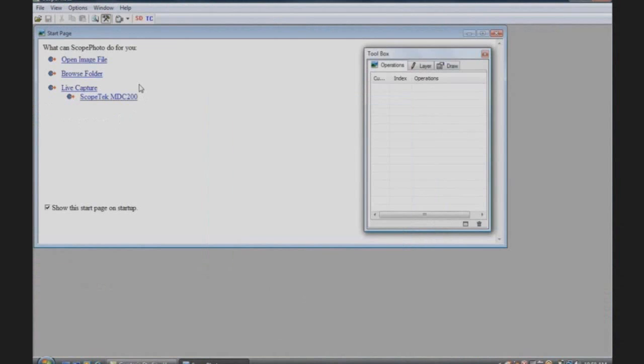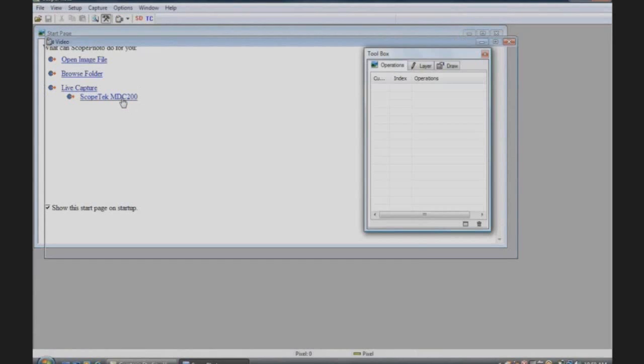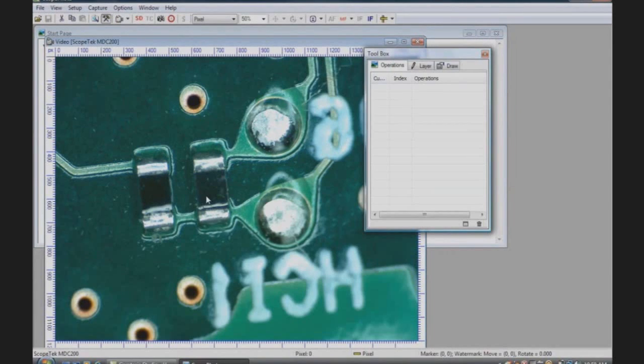To test the camera, double click the camera driver under Live Capture. Here we have our live image and the digital camera eyepiece is successfully installed.